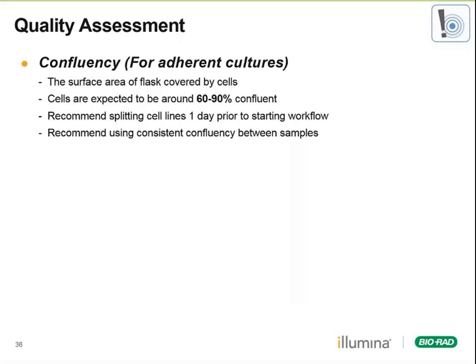However, this can vary quite widely with your cell type, so use the conditions that are best for what cells you're using. If you're new to a cell type, you're probably going to want to look at the literature to identify the best conditions for those cells. We recommend splitting cell lines 1 day prior to starting the workflow. This gives you enough cells to use while also not letting the cells adhere too closely to each other.